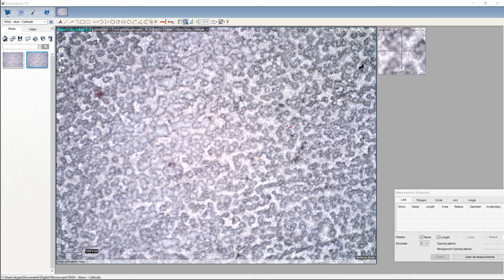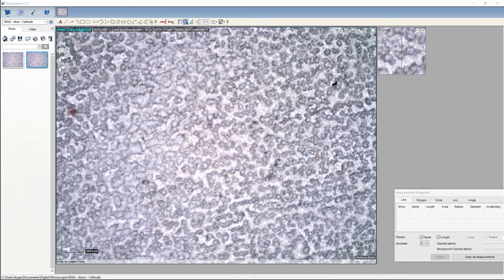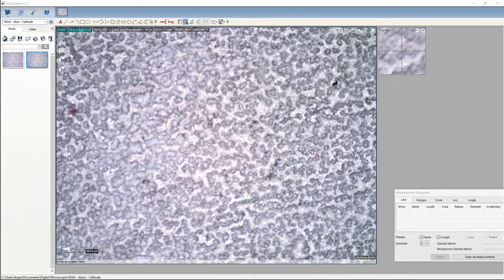This is maybe aluminium oxide or something, maybe silicon if there's a proton being rammed in there, because this is the cathode, so bare protons would be attracted to it. And could that be making silicon? That would be interesting, wouldn't it? And what would be even more interesting than that would be if maybe these shiny bits are iron. But who can say? Let's go and have a look at this with a bigger magnification level.